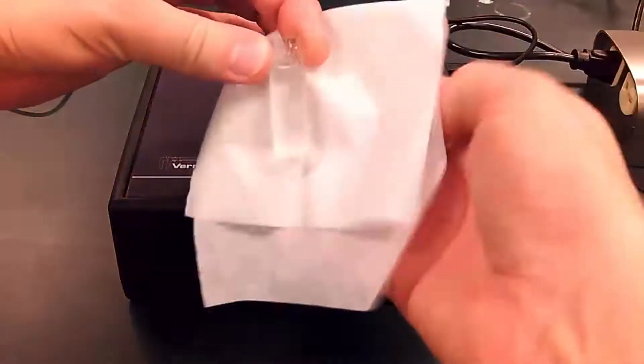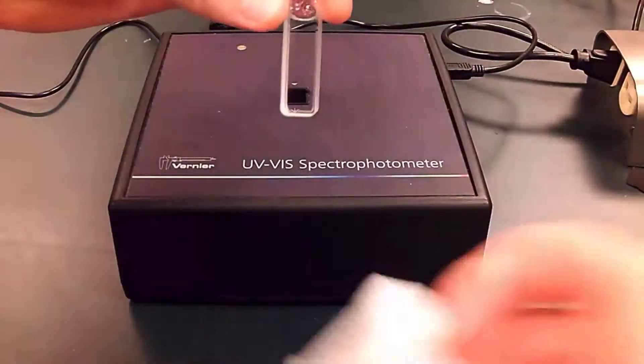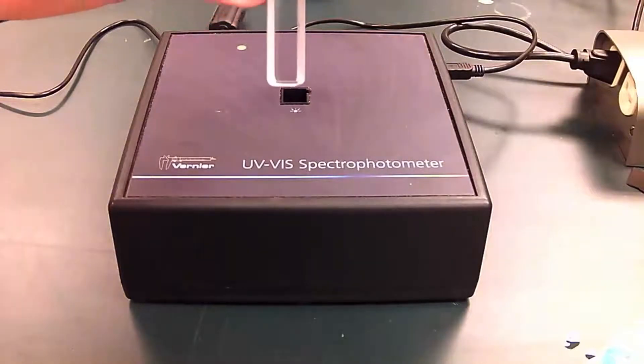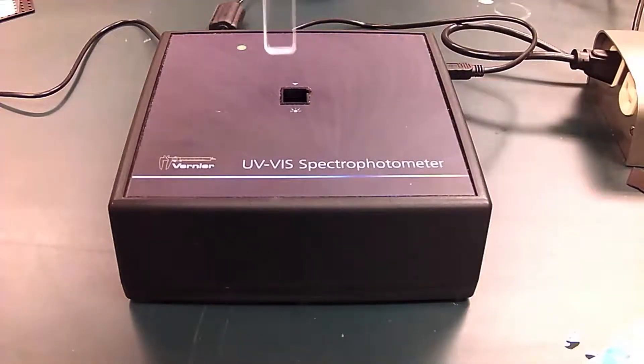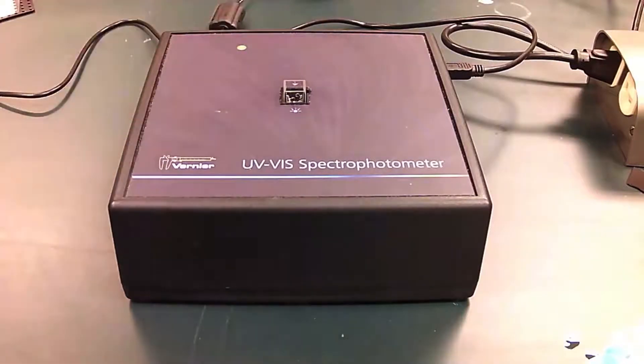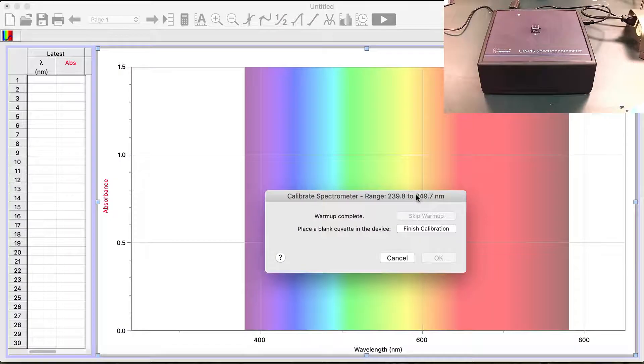I'm going to start by taking the fancy scientific tissue called a kimwipe and wiping off the sides so that any dust, fingerprints, or water droplets on the side don't go into our instrument. Then you push the cuvette in, go to the software, and tell the software this is the blank. I have it all set up, push the button, it thinks for a second, and then it says okay.